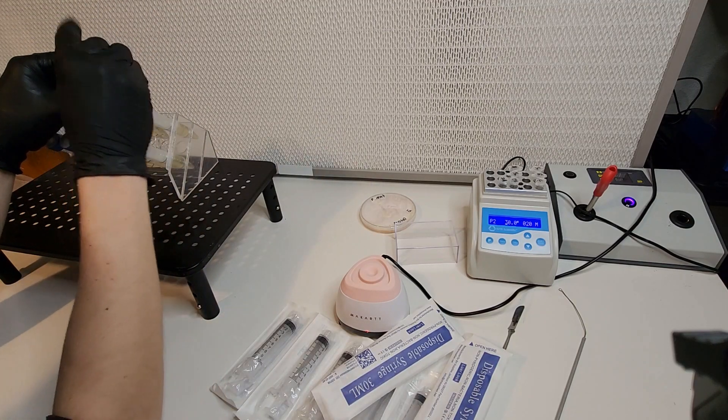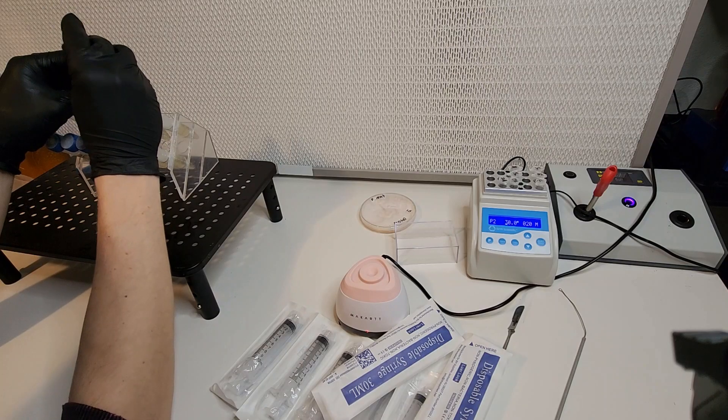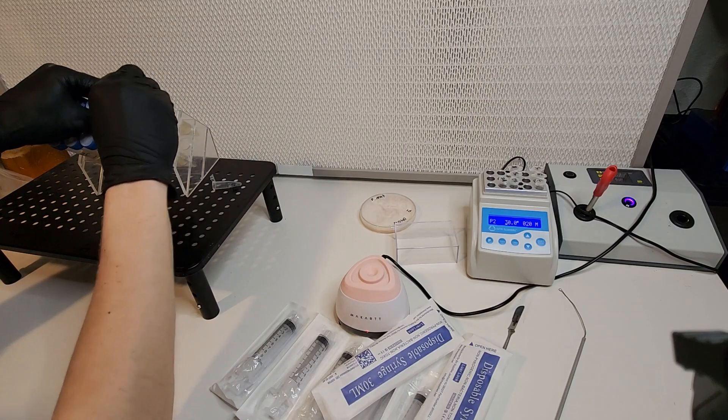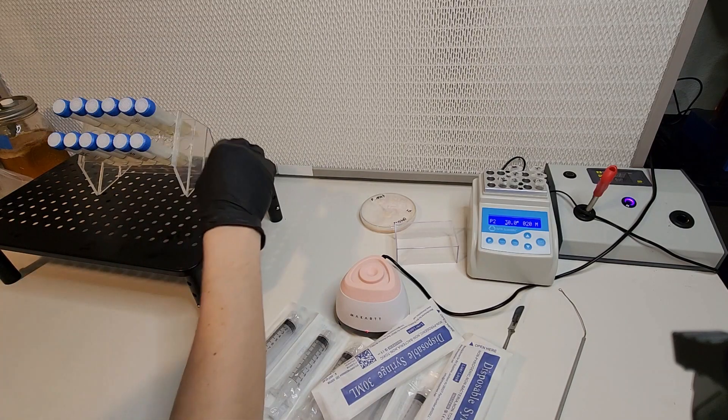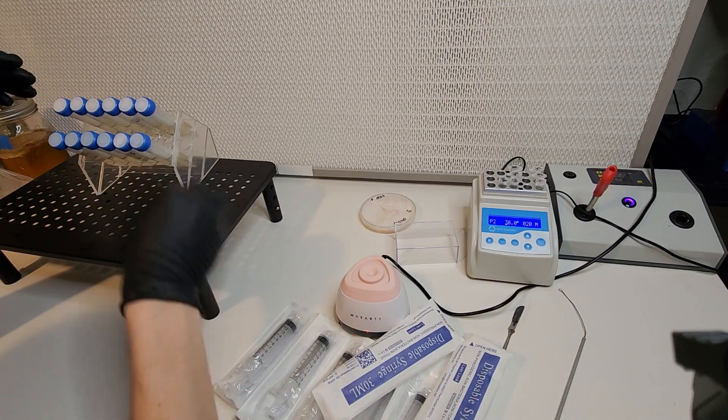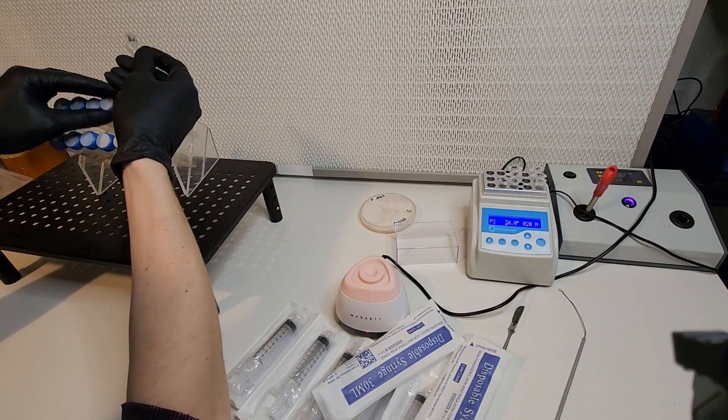After the 90 second heat shock phase, you let it cool down and then dump your tubes into the bioreaction tubes. So you take the little microcentrifuge tube with your sample, open it up, take your bioreaction tube, open it up, and dump it in there.